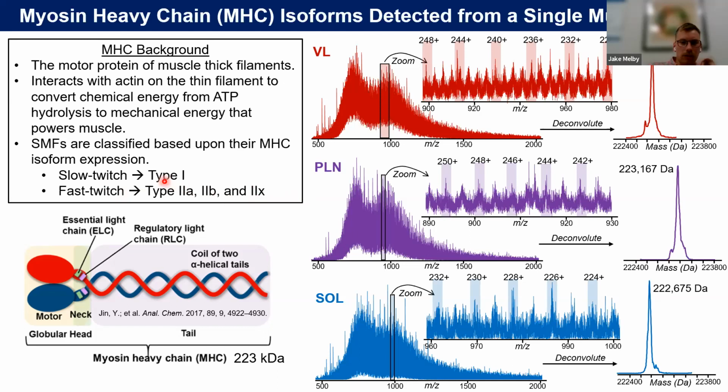So usually we do not see this protein in our conventional workflows, usually because it coelutes with actin, which is about a 40 kilodalton protein. So much easier for top-down to manage. But again, due to the fact that my chromatographic peaks were so sharp, I was able to get several scans consecutively of just myosin heavy chain as it was coming off of the LC column through the Newomics source.